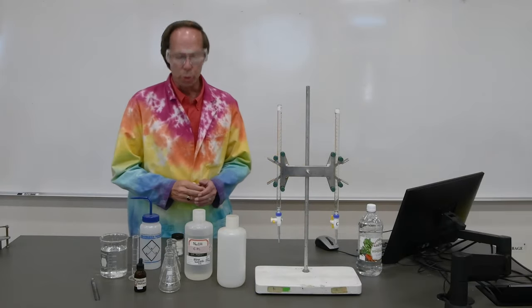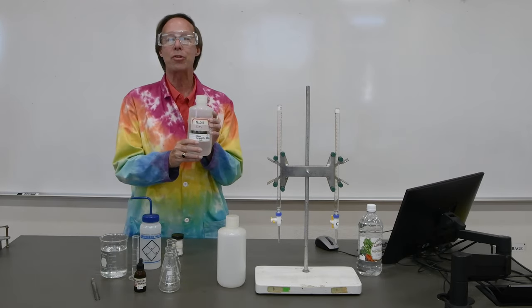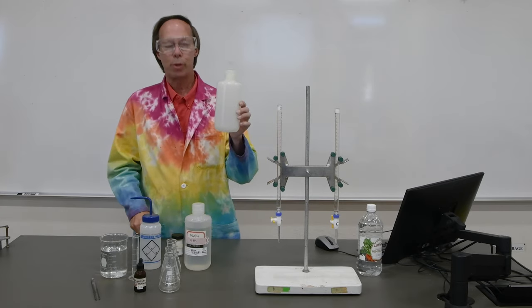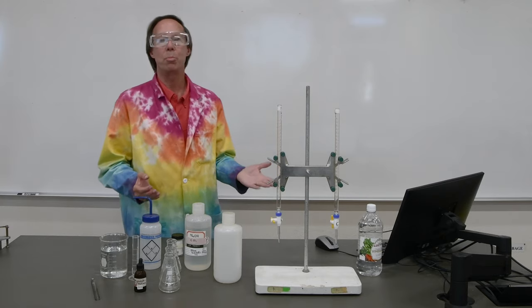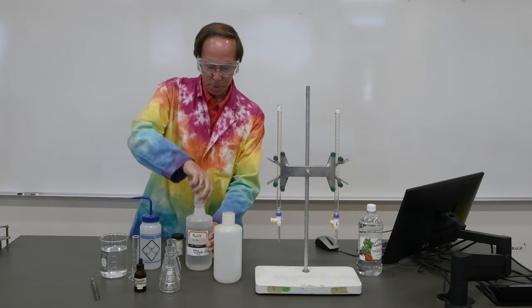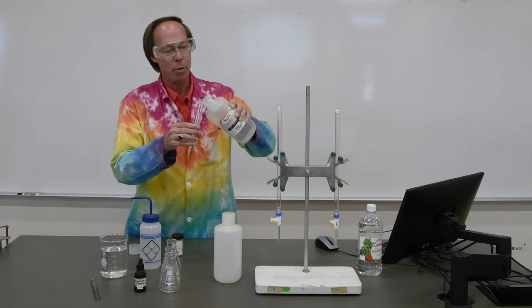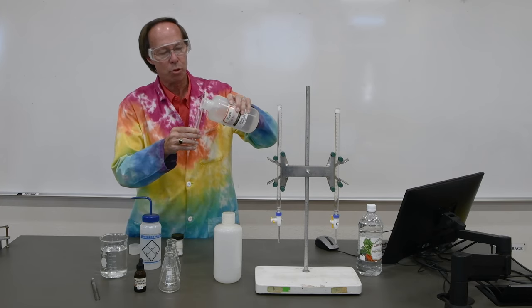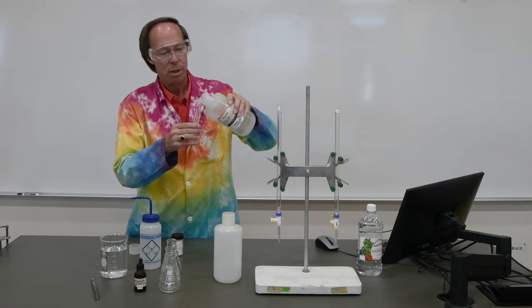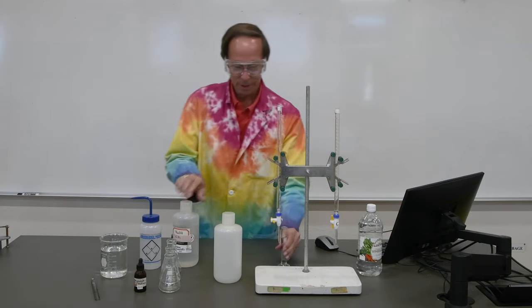The first thing we need to do is to dilute our sodium hydroxide solution. So we have our 6 molar sodium hydroxide, and we're going to dilute it in a clean plastic bottle to make our approximately 0.3 molar solution. So the first thing we'll need to do is measure out about 25 milliliters of the sodium hydroxide. It doesn't have to be exact because we're going to standardize the solution in a few minutes anyway. So that's just slightly more than 25 milliliters, but that will be fine.